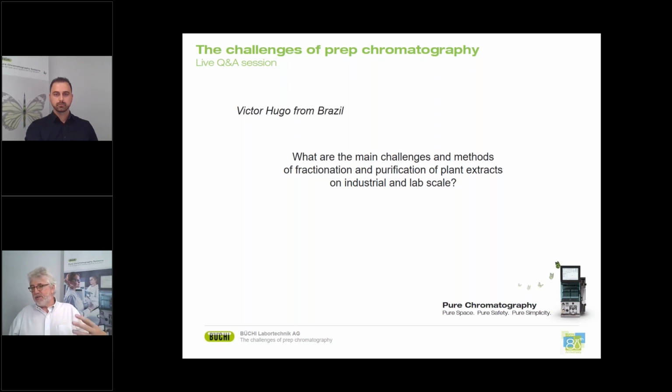Or there will be a step to remove chlorophylls with the distillation or an active coal filtration. So it really depends again on what the customer wants and needs finally, and what is present due to the extract he is doing. And again, for us, that's a difficult one.